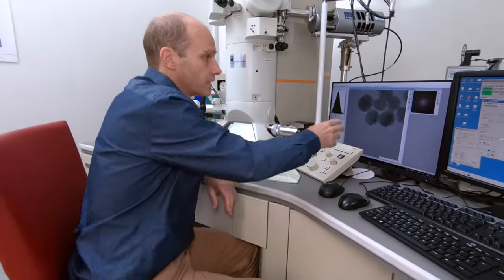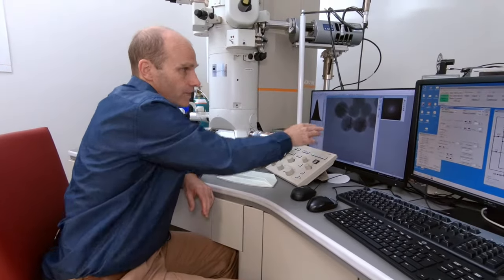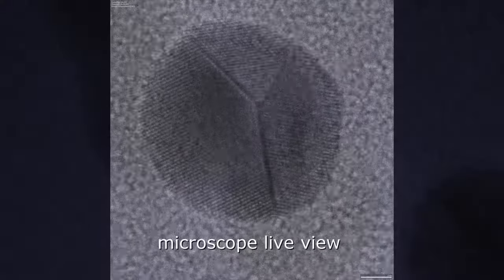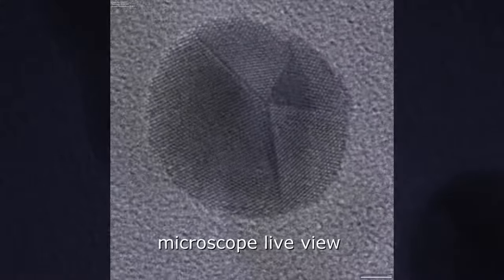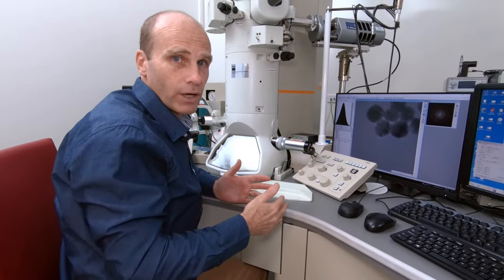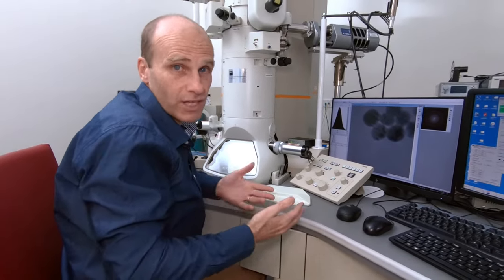And so now we can see the lattice fringes that we have in our sample. This can give us the structural information. We can see features which are as low as about 2 angstroms in size. And we can use this to help identify what our sample actually is. In this case, gold nanoparticles.